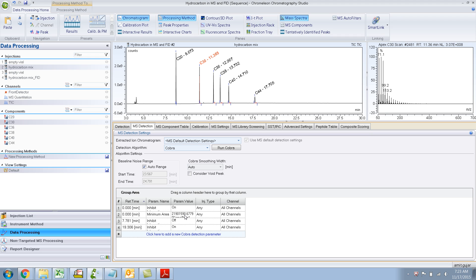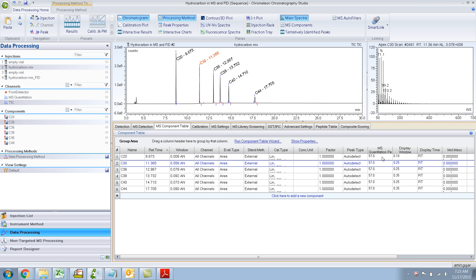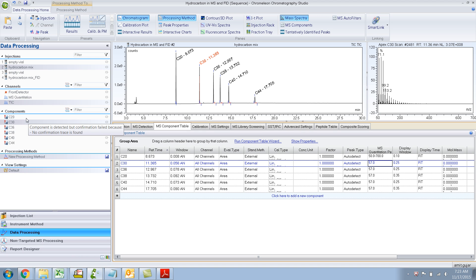But remember, this minimum area is applicable for everything - not only for TIC. So if I put something like 50 to 700 and hover around this, it shows a different error: 'The component is detected with confirmation failed because no confirmation trace.' Whereas for this one, the reference could not be found. So there are two reasons why the exclamation mark is there.